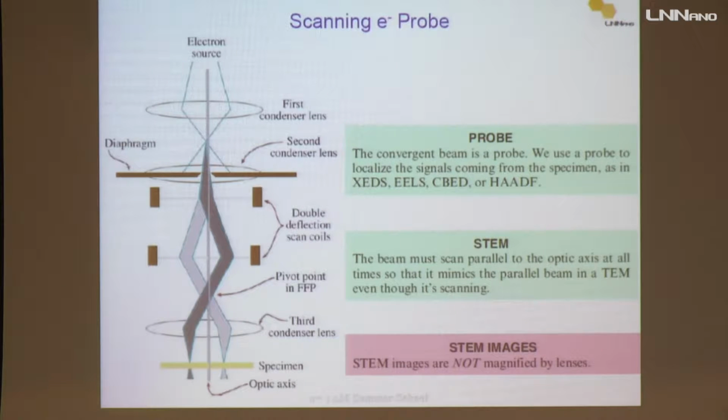Well, for the STEM, we will scan the probe. Okay, I guess Professor Zagonel told you about this mode of operation. Okay, we will generate a probe that is very much useful for spectroscopic experiments, okay?